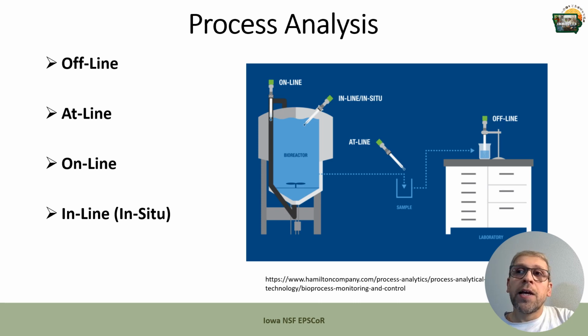That is, it increases the chance of contamination in our bioprocess. So we shift to online sampling. Online sampling minimizes the time needed for doing experiments, but still the danger of contamination remains.